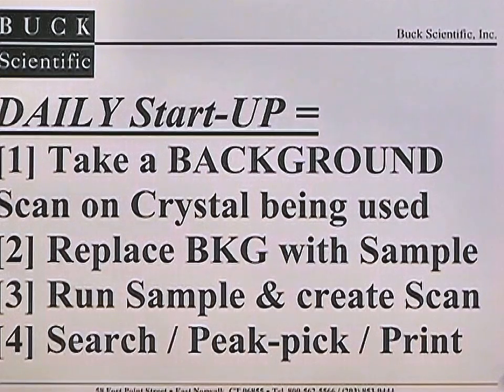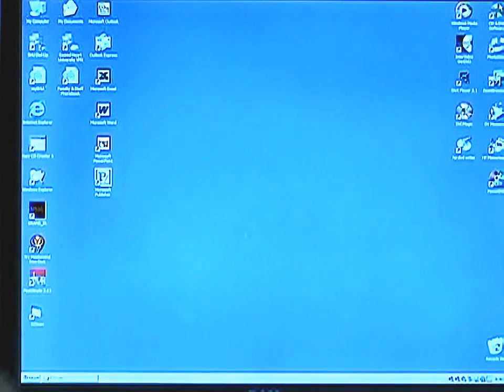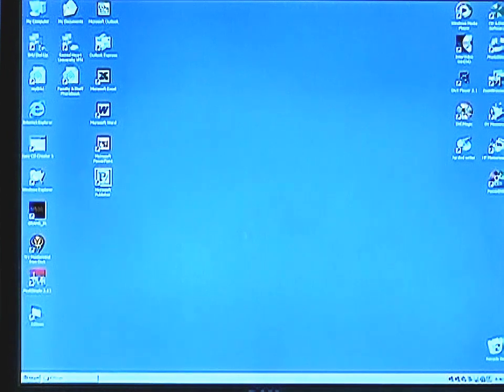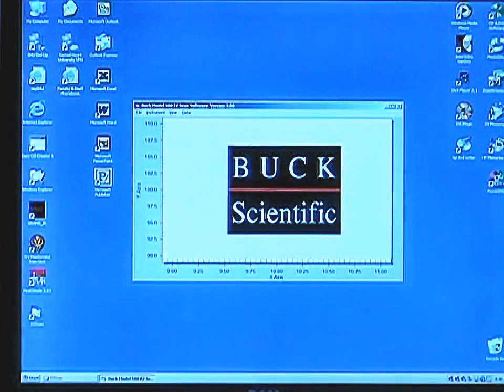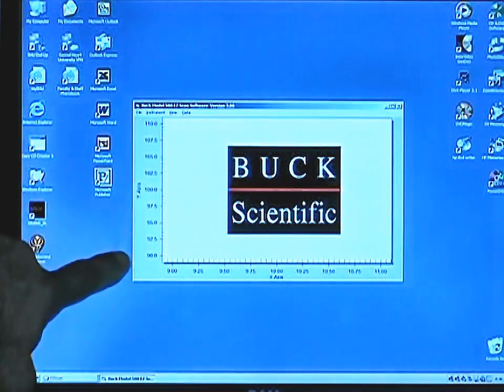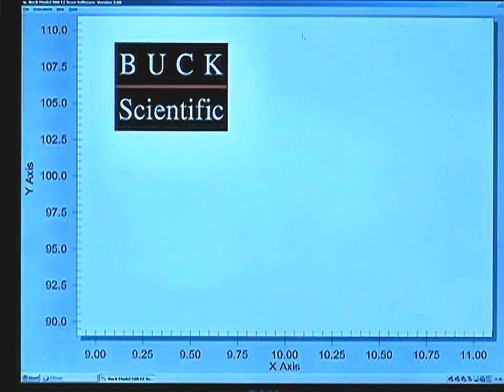From that spectrum, you can do search, peak pick, or print as desired. Double click on the EZscan icon, making sure the data cables are connected to the back of the PC and the instrument, and you'll get the Buc Scientific logo in the EZscan screen. You can maximize this as necessary.